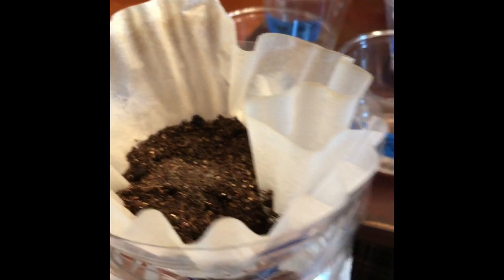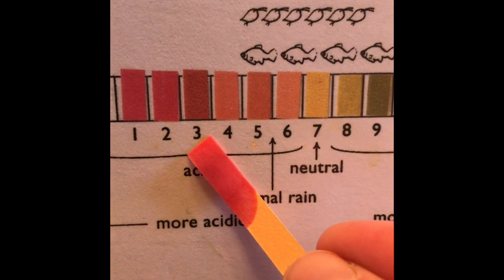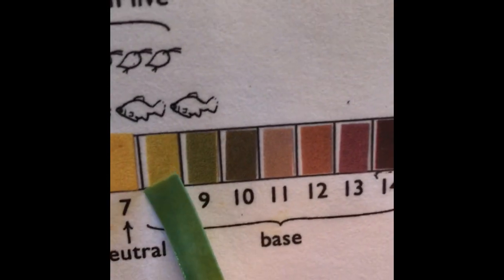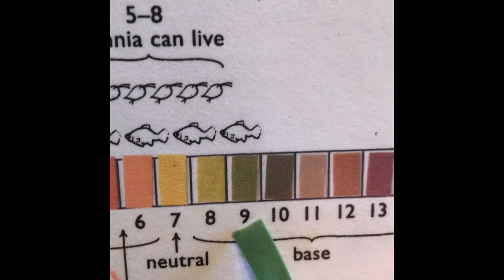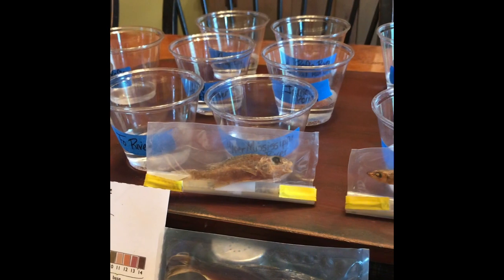Rafta area soil runoff was tested. So the water for Rafta area soil runoff is going to measure at a 4, pH of 4. The Faux Mississippi soil runoff water, so the Faux Mississippi River area runoff, is going to be a pH of 9.